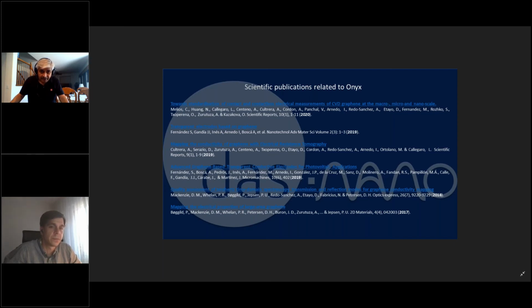And Neil Dilly has asked a question, what is the frequency range available? The frequency range in the terahertz range is up to 5 terahertz. So from 0.1 terahertz up to 5 terahertz. This is where we have enough signal to noise ratio to characterize the samples.